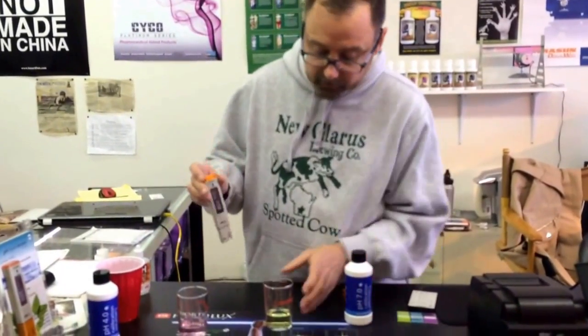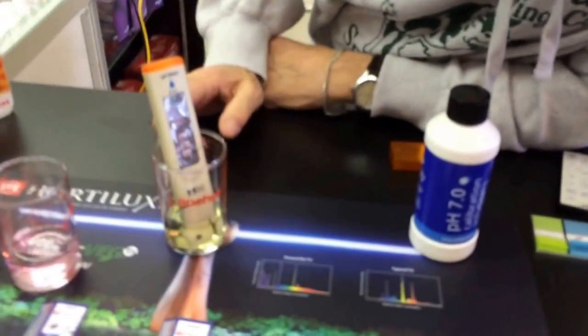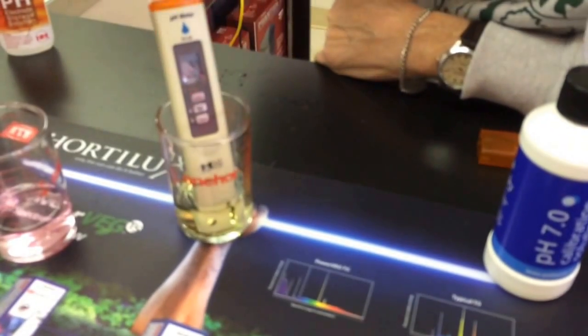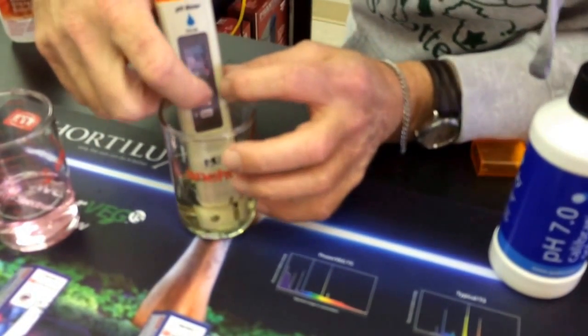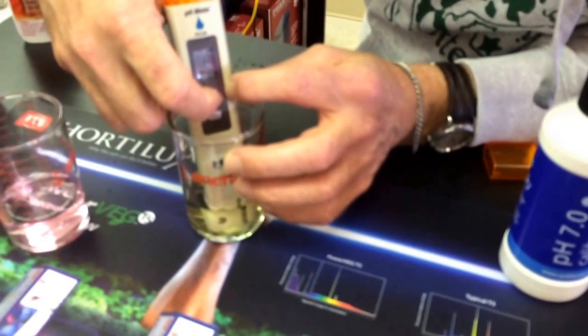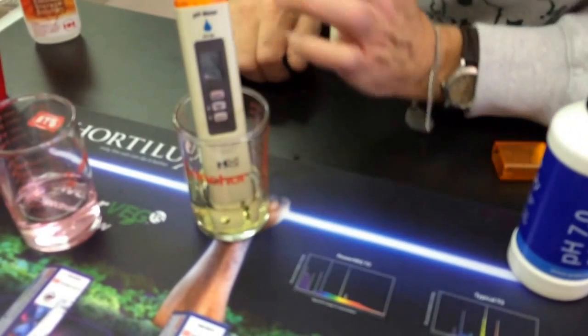The meter is on right now. We stick it in the solution, and once you stick it in there, you'll start adjusting to see what it is. So what you do is press the middle button — Calibrate — you hold that in, and once you hold it in, it should start flashing calibration, and it starts doing its calibrating.